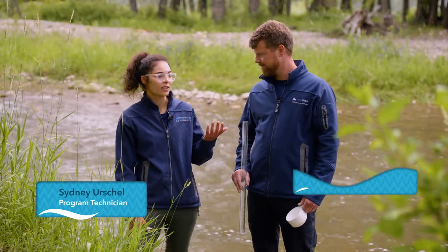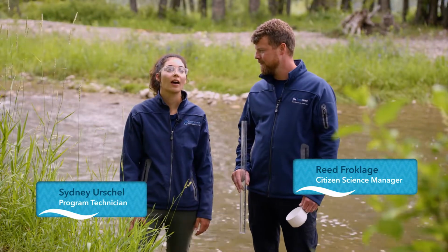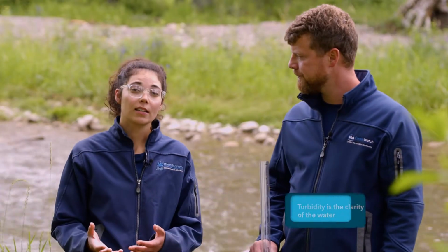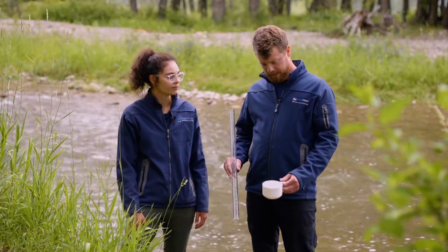I'm Sid and this is Reed, and today we are going to teach you how to measure turbidity in your creek. What is turbidity, Sid? So turbidity is the clarity of the water. A more turbid creek is going to be less clear, and a less turbid creek is going to be clear. Okay, that's good to know.